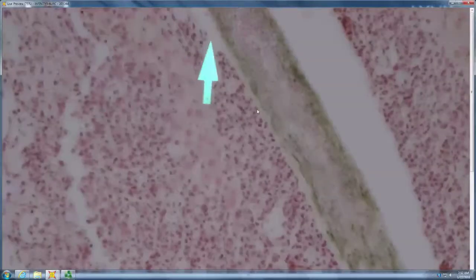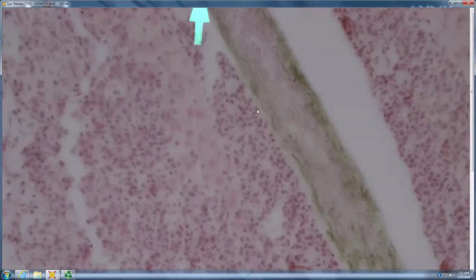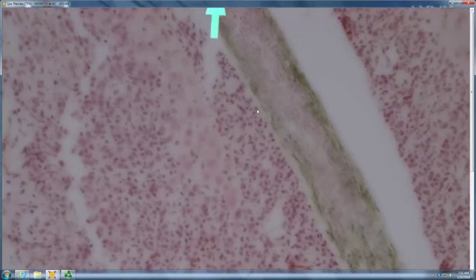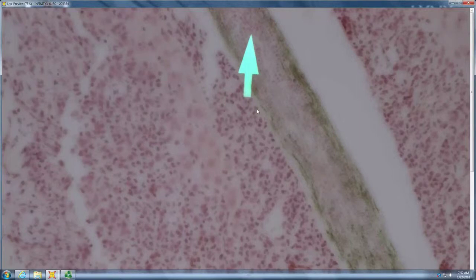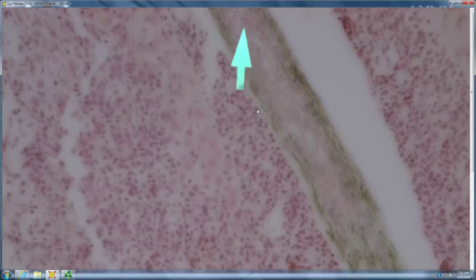So what is this? An endothrix. Endothrix. And compared to the blood cells, are the spores the same size or much smaller? Smaller. I wouldn't say much smaller though. So you need to see spores to get a sense for what's large and what's small, but this is a large spore. Small spores are tiny, tiny little things, about a quarter that size. So that's a large spore endothrix.